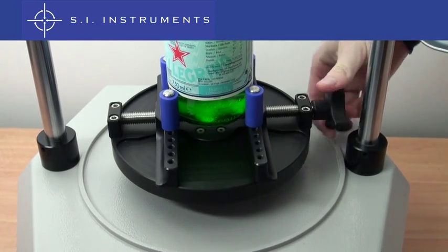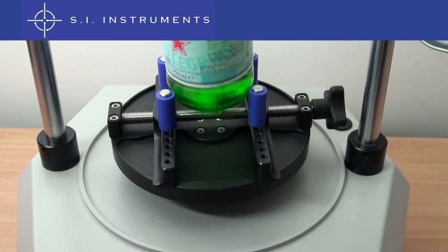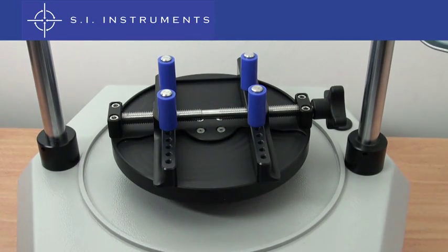After the test, the centre bar can be brought back to its original position and the bottle can be removed, ready for the next test.